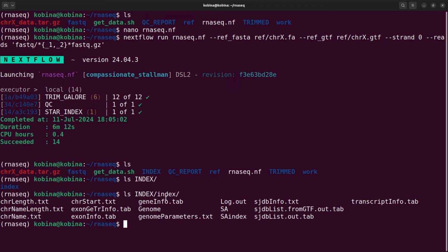There are different ways depending on your objective and depending on how the script is going to be used. For this script, you are always going to rerun the indexing. All right, so that's something you need to take note of. If you want it modified, you can also reach out to me and we can see how that can be done. Okay, so let's proceed.